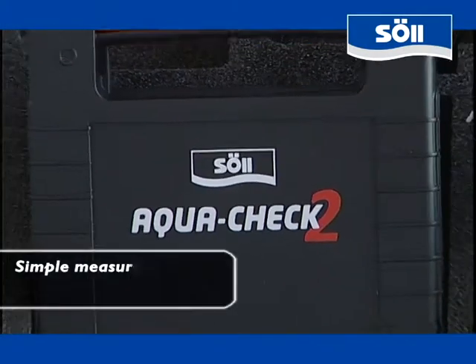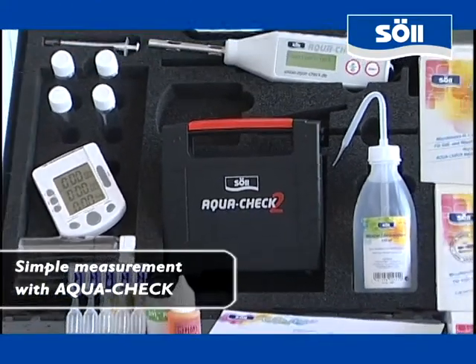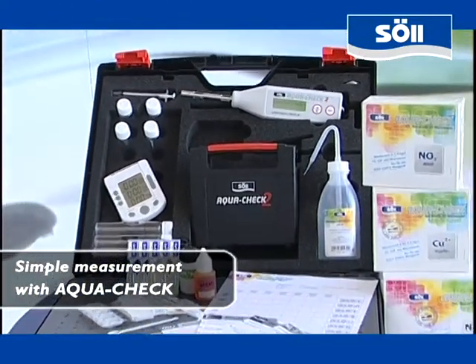There are various methods for analyzing water. With AquaCheck, soil takes advantage of photometry, a measuring technique well known from physics and chemistry.